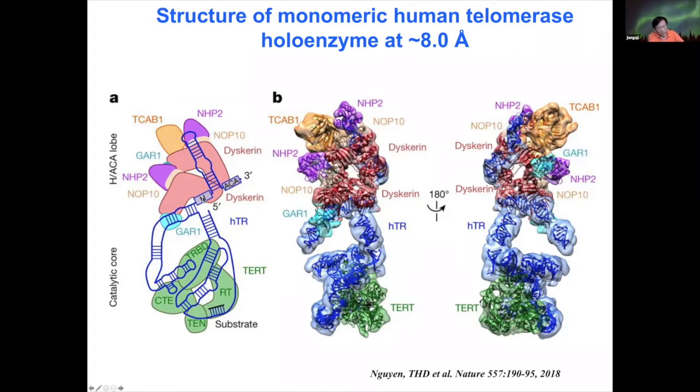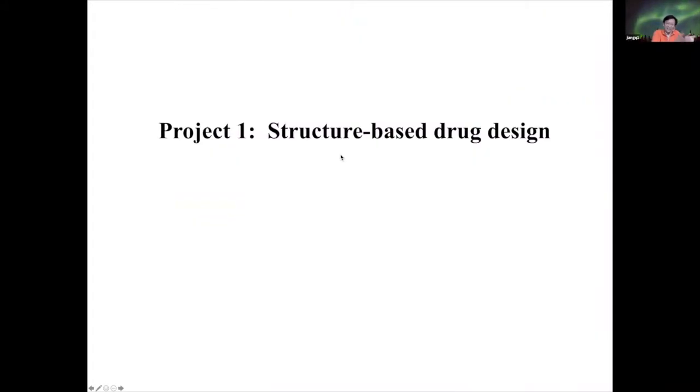At this resolution, it was actually possible to identify for the first time the 10 major components of the holoenzyme, which has not been possible for decades, actually. So this is the brief introduction. If you have any other questions, you can ask me, or you can also email me later after the lecture.